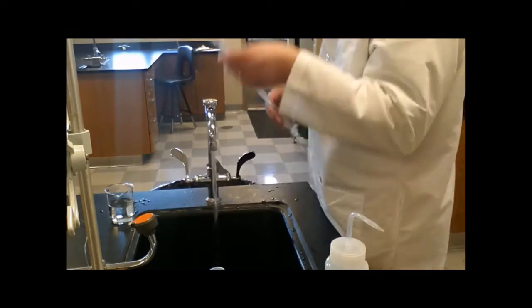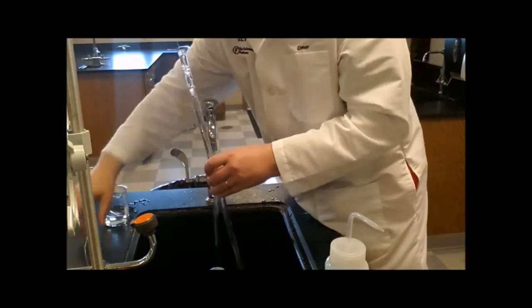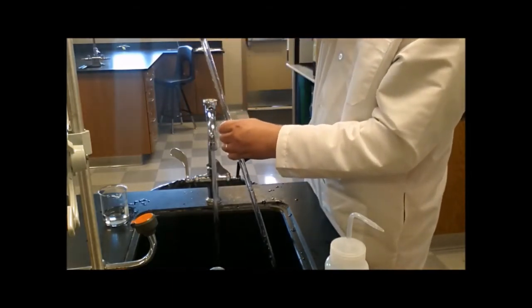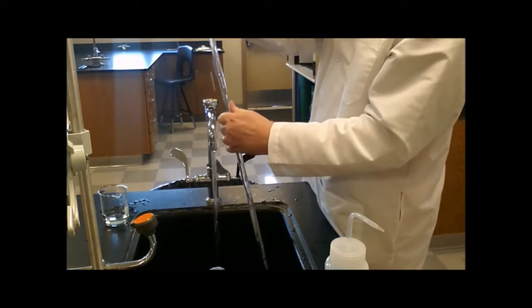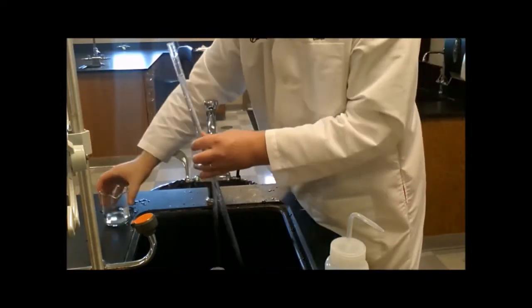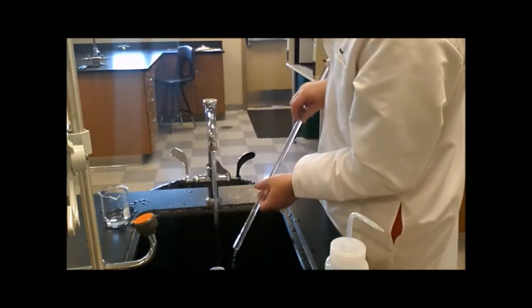I have a little bit of sud sticking to the wall of this, which I've never really seen that do before. So let's fill it up with water, and then let's take a nice non-sudsy bristle brush and give that one more go. Kind of scrub those suds out. And then overflowing, rinsing out the top, overflowing, and then rinsing out, rinsing out.